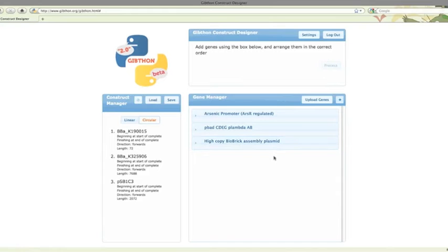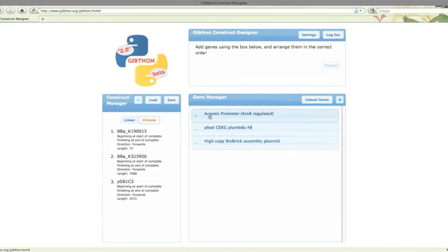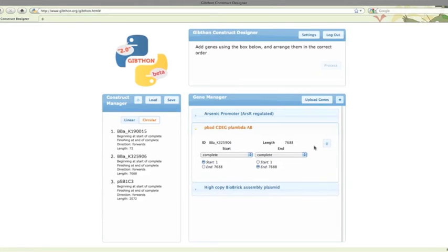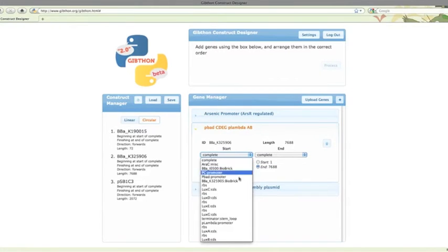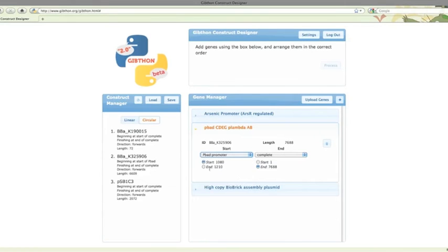The other problem is, we currently have two promoters plugged into LuxCDEG, PBAD on the LuxBrick and the arsenic promoter, which is obviously not going to work. Therefore, we need to make sure we only select from the end of the old LuxCDEG promoter. That's PBAD. Job done.